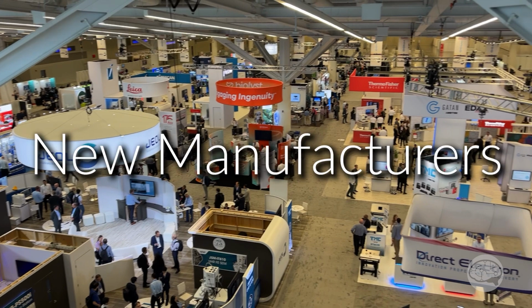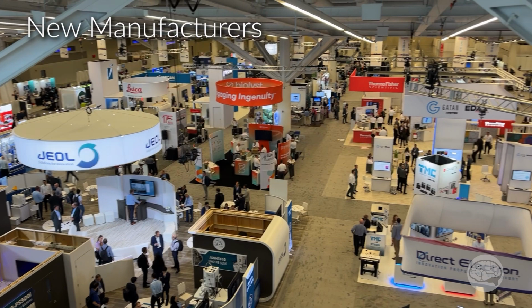New vendors. One of the really interesting things about this particular conference was the very large number of new electron microscope manufacturers that were there. If not for the first time, then they were relatively new. Now, a lot of these will just be tabletop SEMs, but not all of them. And so because there are a lot of tabletop SEMs involved in this category, I want to give a little background info about the tabletop market before we get into this.